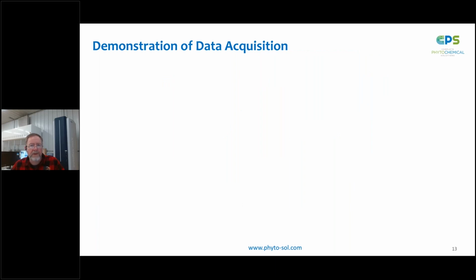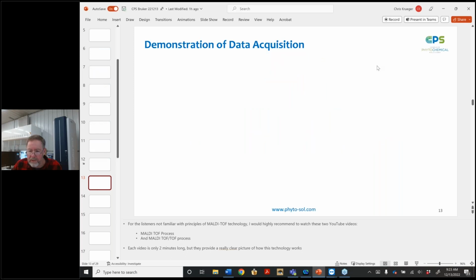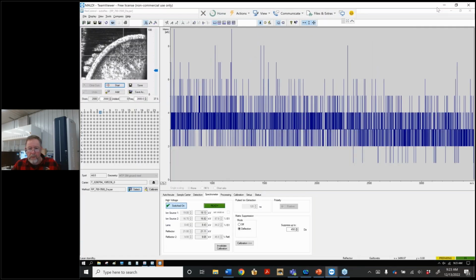Right now, what I would like to do is switch over to the MALDI control and show you just how easy it is to acquire a data set in real time. And then we'll do a little bit of work in the Flex Analysis software package to show you the interpretation of the data. And then I'll come back into this PowerPoint presentation. So let me escape this and then switch over to our Flex control here. And hopefully everybody can see this now.